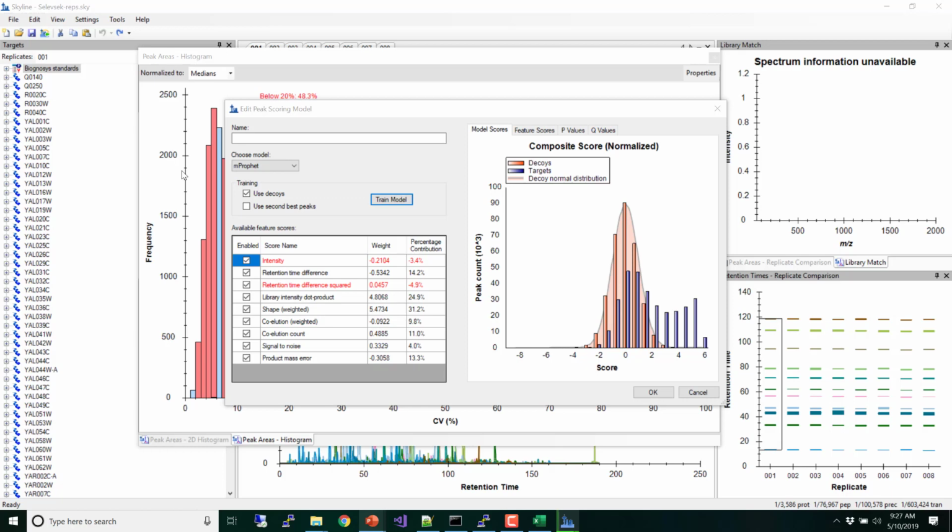Well, what Lindsay is doing is this whole thing where she's doing dilution series into another matrix, and they really are trying to do a refinement where they decide, hey, this is quantifiable. But we're just doing, is it repeatable? What I think we'll find when we do the statistics is that just that one experiment improves the set of peptides that we use to measure our proteins, as things that, when they stay the same, we measure them the same. Like we reduce the variance. So anyway, here's our model.